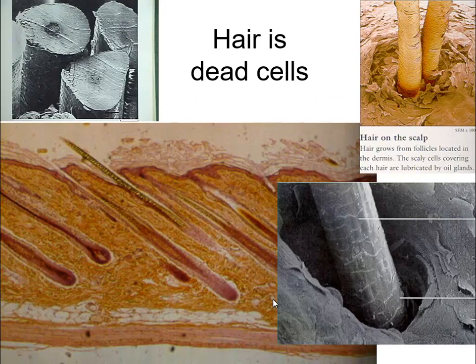Here is squamous epithelium, and at the bottom right is hair. You can see the flat squamous cells making what looks like a tree trunk — that's actually your hair — and there's a hole which is your hair follicle. Sometimes you get an infection in the hair follicle or a pimple. At the top right it looks like a tree trunk as well, and you can see the squamous cells in the outer layer are dead and starting to branch off. You can see that this person has a rough cuticle on their hair.